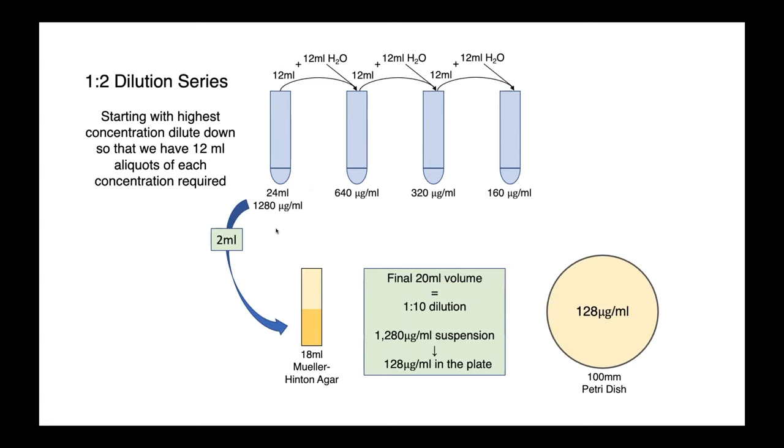The next step is to incorporate these antimicrobial suspensions into agar to give us our final media that we'll use in our susceptibility test. We take 2 milliliters of each suspension and combine that with 18 milliliters of molten Mueller-Hinton agar. So we have a final volume of 20 milliliters, which gives us another 1 in 10 dilution.